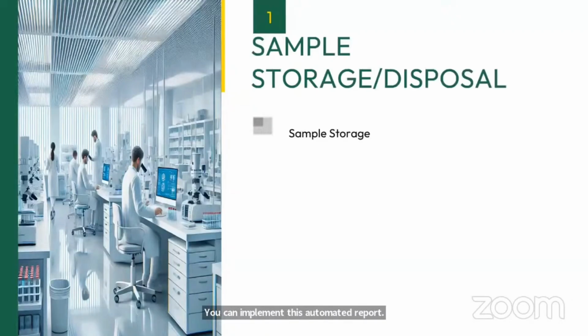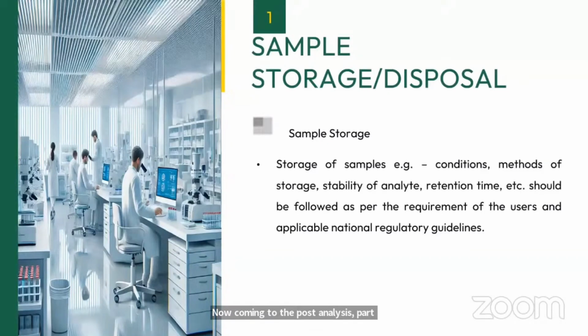Now coming to the post-analysis part, sample storage. Whenever you are storing any sample, routinely we store samples for a specific period of time. After the examination is performed, for a specific duration, the samples are still retained in the laboratory. So what are the prerequisites, under which conditions are you going to retain those specimens?